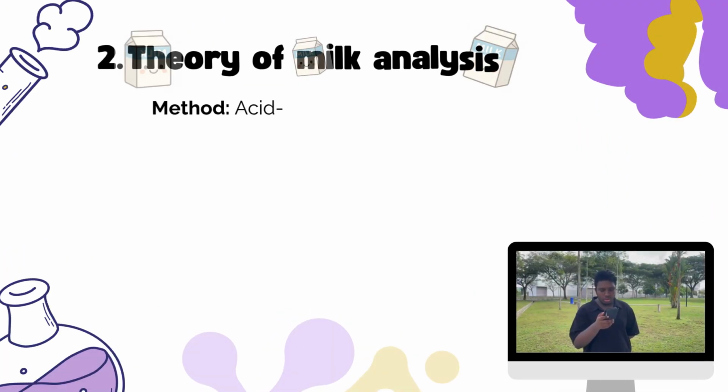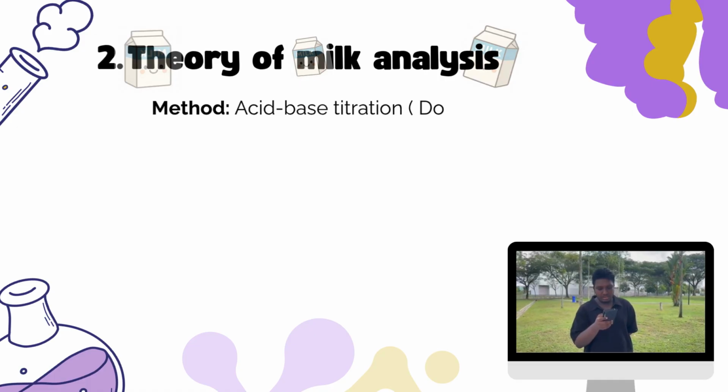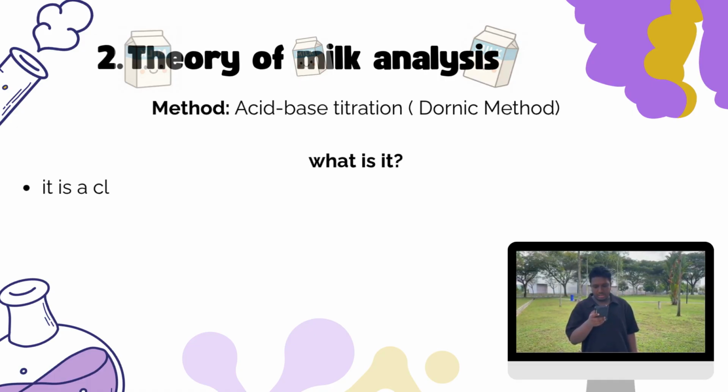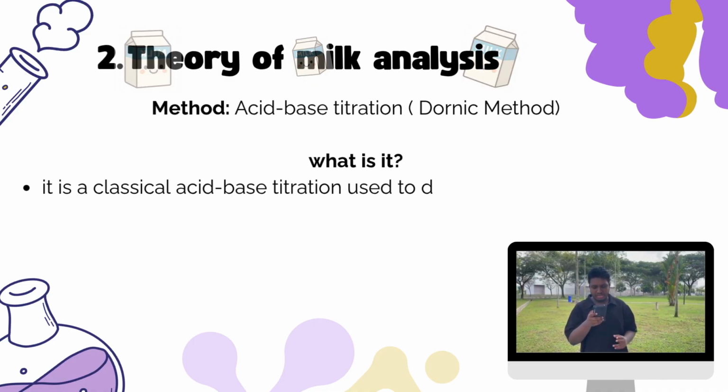I want to talk about the theory of milk analysis. What is the method used for this? The method we are using is the Dornic method. Basically, it's an acid-base titration.